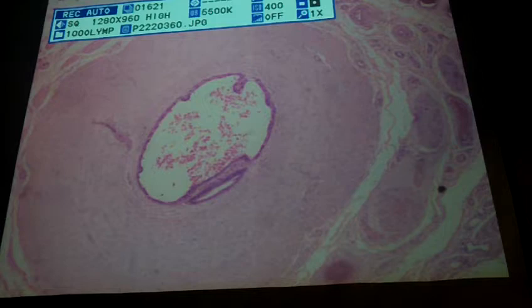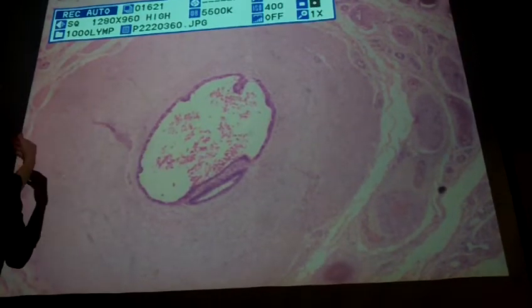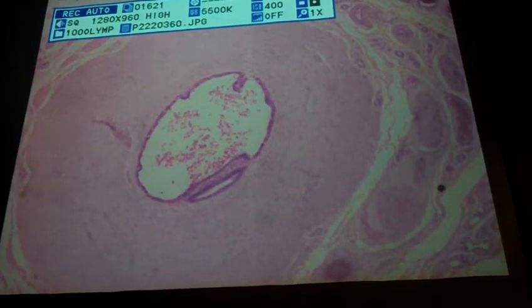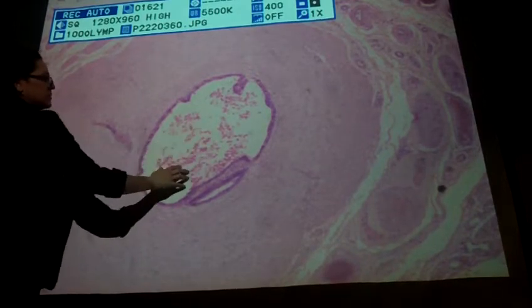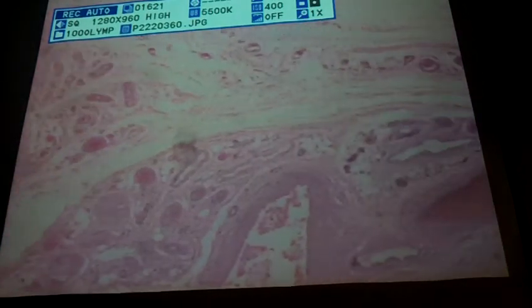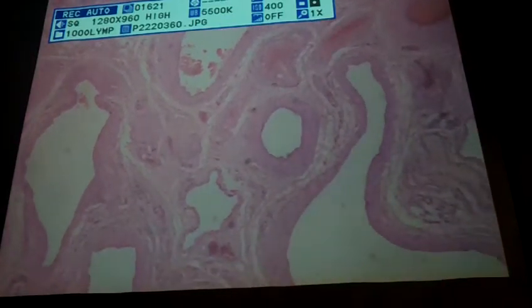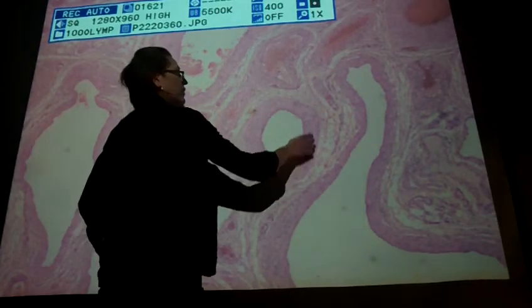So that one you can see, huge layer of smooth muscle, very circular, lined with simple columnar epithelia or pseudostratified, one of the two. See some sperm cells in there, but again, you don't necessarily have to see sperm cells. If we move over and look at arteries versus veins, this is a good section here. This right here would be an artery.